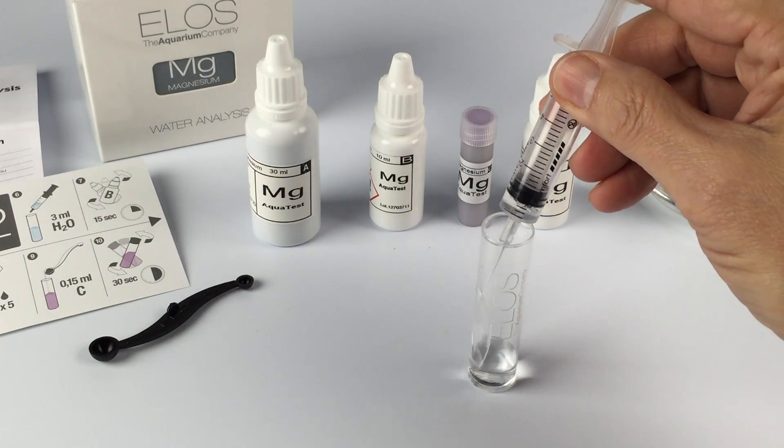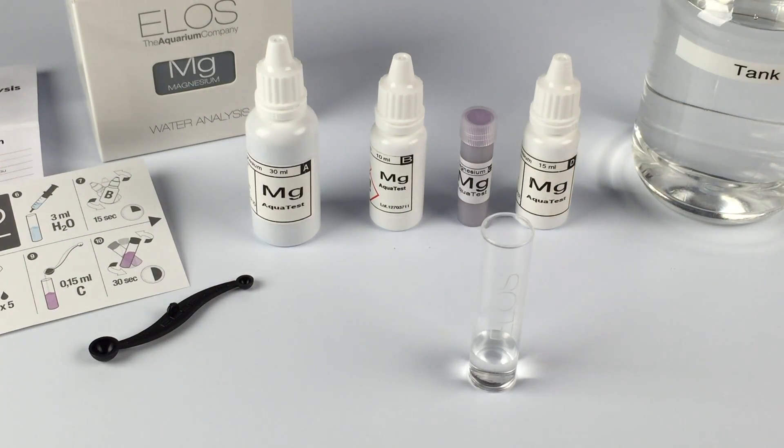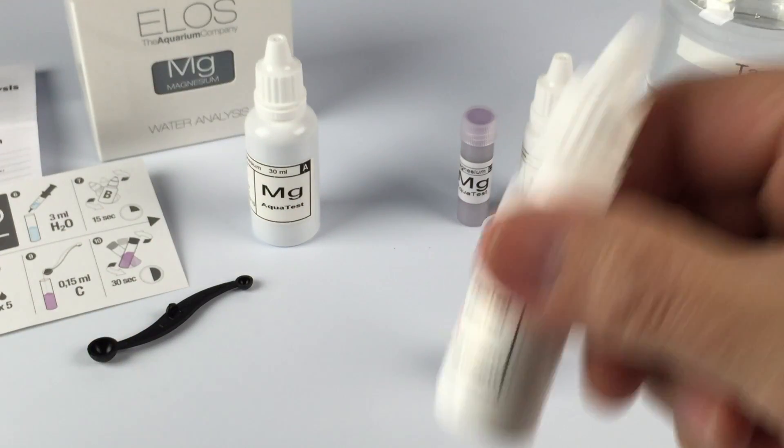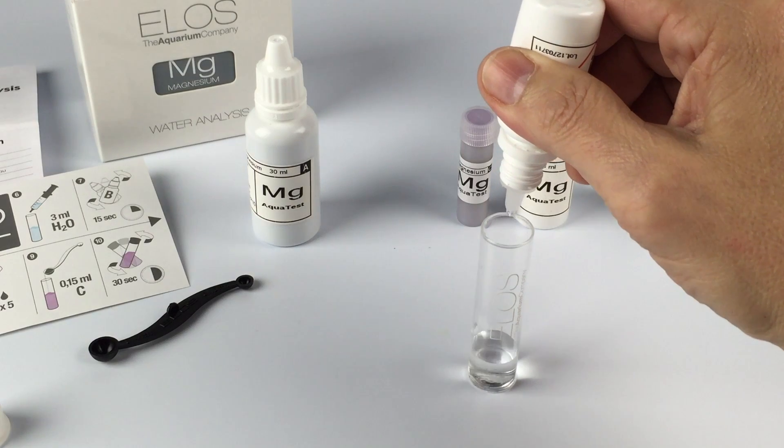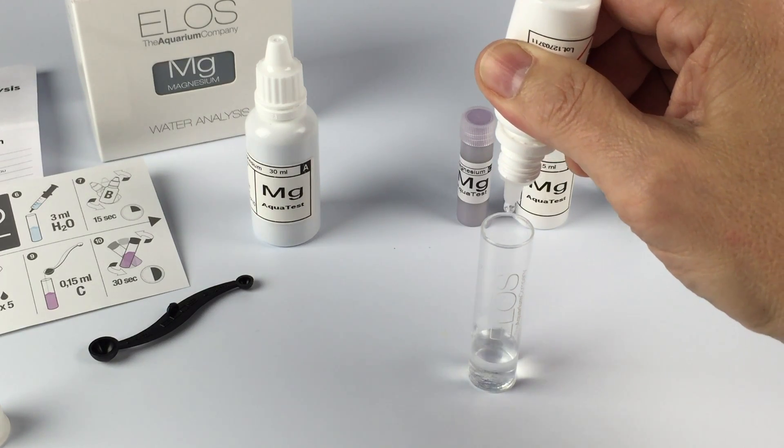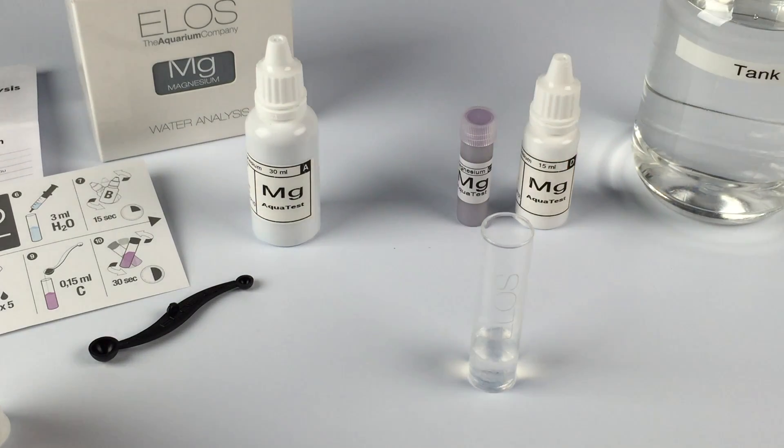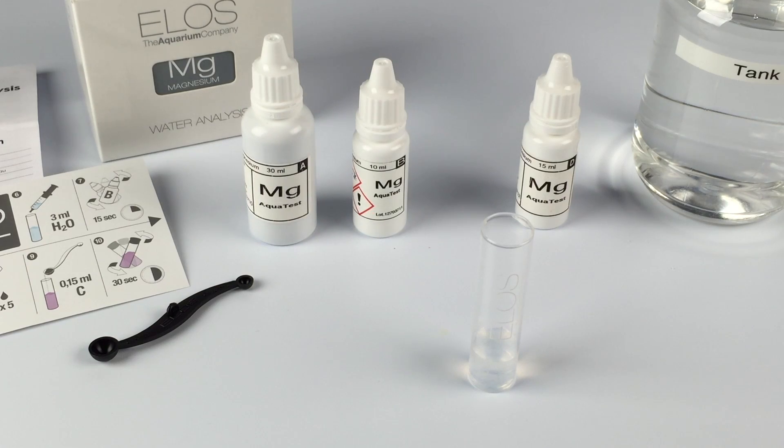Now that the vial has been cleaned out, add 3 milliliters of tank water again. Shake Part B for 15 seconds and add five drops to the vial. You don't need to mix it yet because we're going to add a scoop of Part C, the powder.